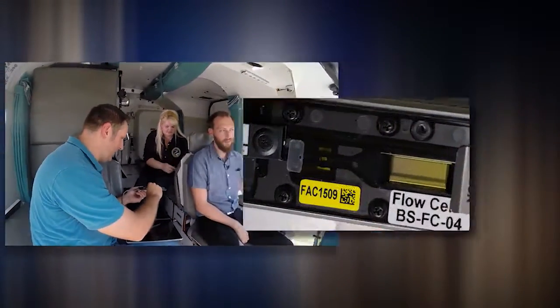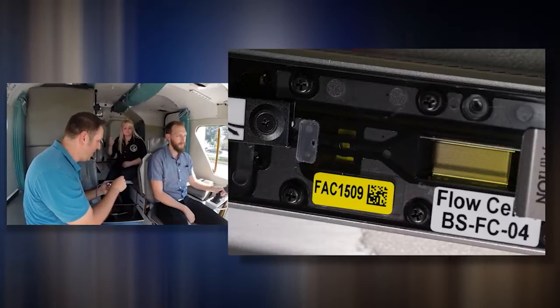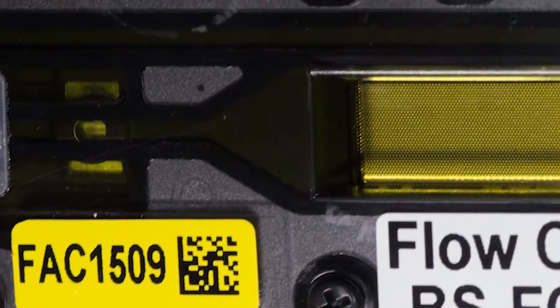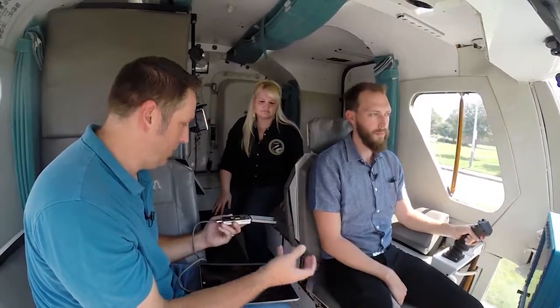So in this little window here, there's a bunch of what are called nanopores. They're biological proteins that exist in normal cells, and they allow ions to flow through. And it's just big enough to let a single strand of DNA actually pass through the pore. When there's nothing in the pore, you get a certain fixed current. And then as DNA passes through it, the pore gets blocked and the current is reduced. And so it's that change in current that tells you what the sequence of DNA flowing through it is.